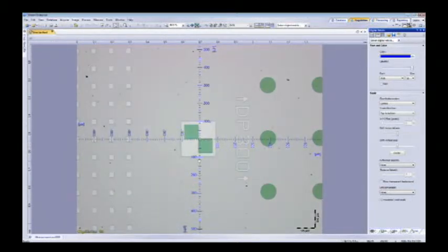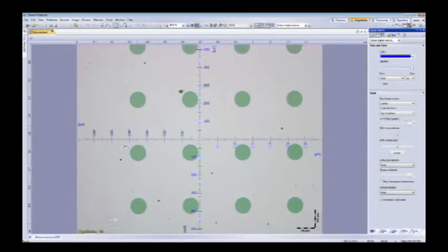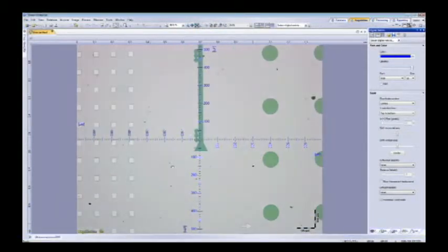We know it's about 200 microns width. This is a way for them not to have to take pictures and manually measure, just quicker. Drive to the points, move it in between the reticle here, and get a measurement. Now, is that shifting the image, or is it actually driving the stage to that point? This is actually driving the stage to that point, so we can keep going and bring anything we want to the center of the field of view by clicking and centering.